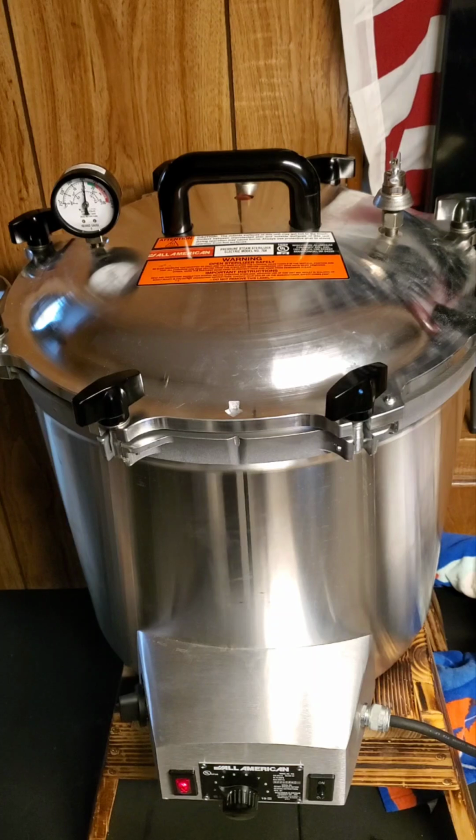All right, you should see it pop off, see it pop back on, right at 15, and boom, that's perfect. So mess around with yours, see where it's set at, but this is where mine is, coming with factory settings. Turn this back on in 2.5 hours from now. It is approximately 2 minutes till 1400 or 2 minutes till 2 p.m. here. So that'll be 1630 or 4:30 for us.